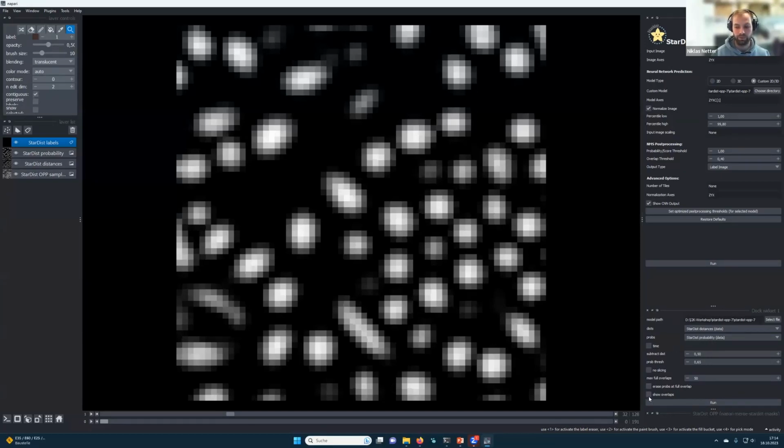Again, here we have a lot of additional parameters that are interesting, but for now we will not discuss them. And if you're interested in them, please let me know later and we can discuss a little bit about them if you have questions about them. Next, we click on Run. And now my computer will take, I don't know, 2 to 3 minutes to run and to create the segmentations, because this step just is a little bit more intensive computation.